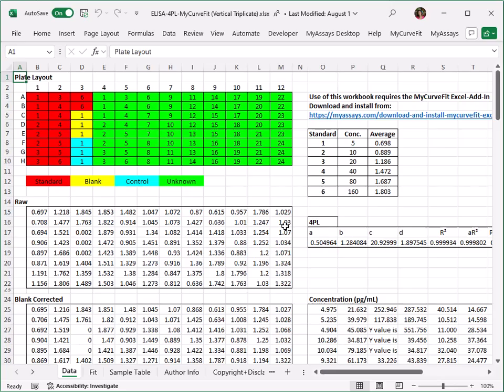As a reminder, you can always update your template to any layout configuration required. Just update the formulas and references for each step. This can be a little cumbersome in Excel, but once you have your template configured, as long as you use the same layout for each run, you can just copy and paste your data in.